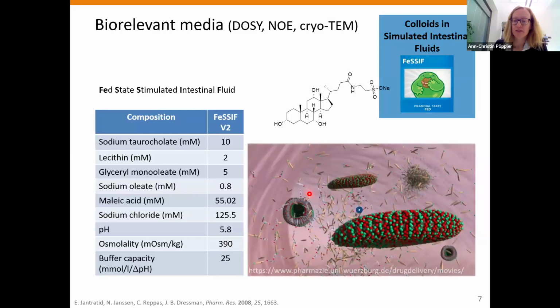So this is part of a video that you're welcome to watch from our pharmacy department here at Würzburg, and you can see that in the simulating media, but this means also in our intestinal fluids. So right now in your gut, you have micelles, vesicles, rod-like particles. So you have a lot going on, let's say an aggregation party going on in our intestinal fluid. And having this now prepared in D2O, it means I can throw polymers at different concentrations into the mixtures.